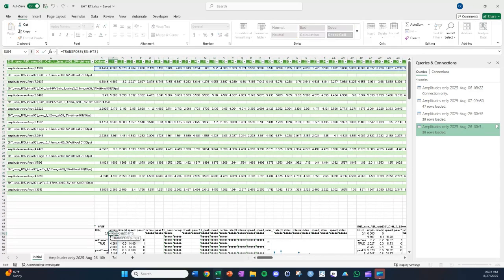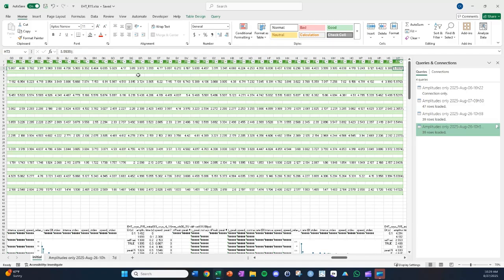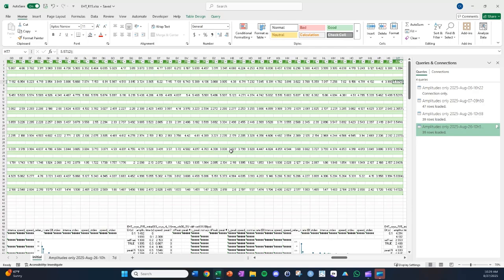So if I double click this, it's including all that data for whatever the first video was. You have to change the name here for only the first video, but it recognizes the name correctly for all subsequent ones in this template. Okay, you'll notice this currently isn't displaying a number. That's because what you have to do is go in here. The way that it imports the data is that it doesn't get rid of this parentheses and semicolon at the end, so you just have to get rid of that in the last cell.